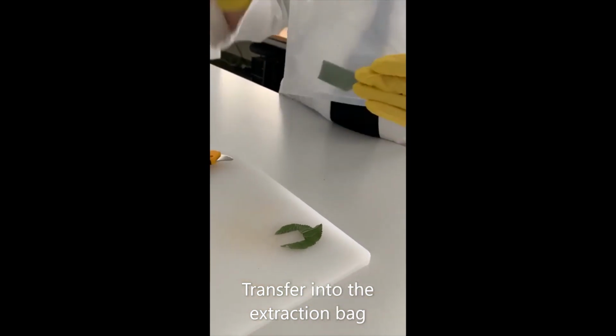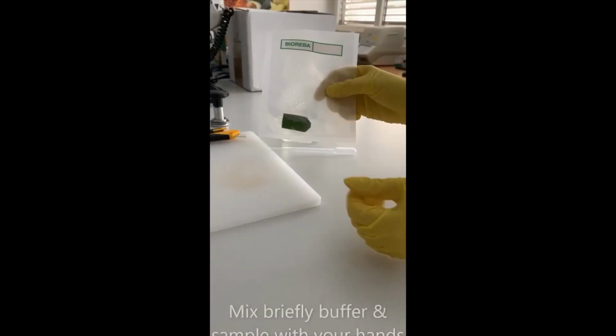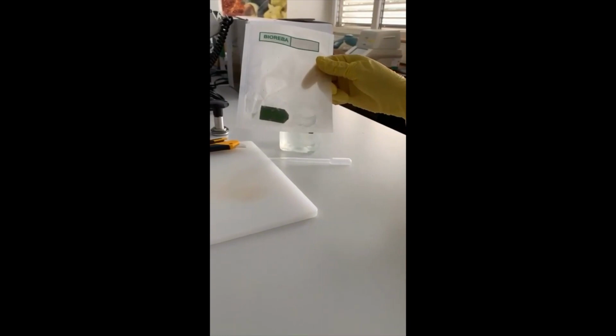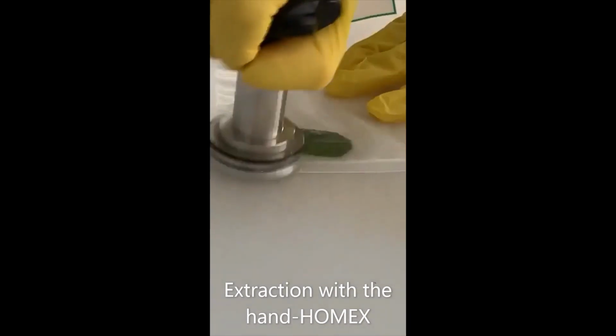So if you place it in the bag, afterwards you will be able to pipette from the front without the pipette getting blocked. So we add now extraction buffer B, 3 milliliter, and this results in a dilution of 1:20 to start with. We briefly mix and homogenize here with a handheld homogenizer.